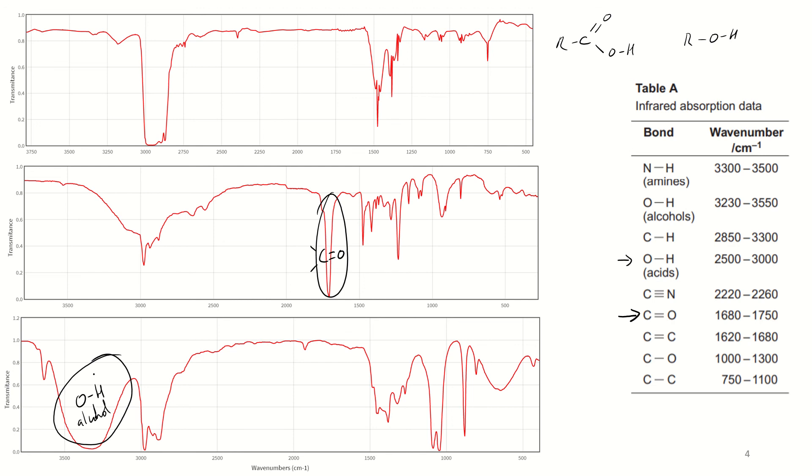And the others? And then the acidic OH, not really as clear as the alcohol one, but again, we can see it there. This broad peak around it is the acidic OH. Now the alkane, it's usually solved by deduction of removing the others because it doesn't have any sort of characteristic peaks. We don't have the OHs up here. We don't have any carbonyl groups in there. Likewise, no alkenes, no nitriles, things like that. So the alkane, all it really has is this CH there. It looks quite pronounced on this one because there's nothing else really on there.